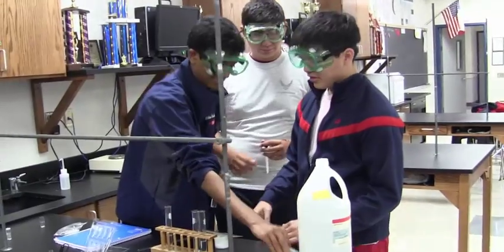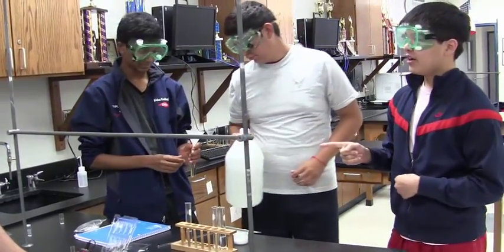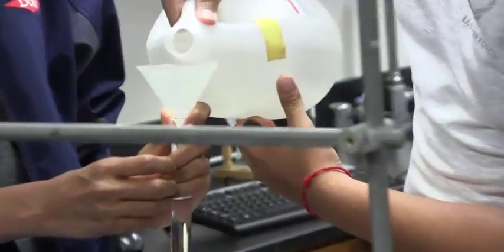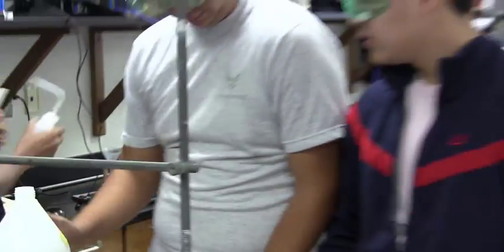So right now the concentration of the solute is too high, so it's off the scale on the graph. So now we're going to have to dump out some of the solution we have right now, and then we're going to continue to add more methanol and water, and that's going to decrease the concentration of the solute we have.